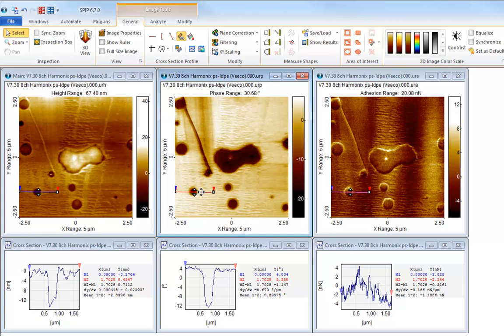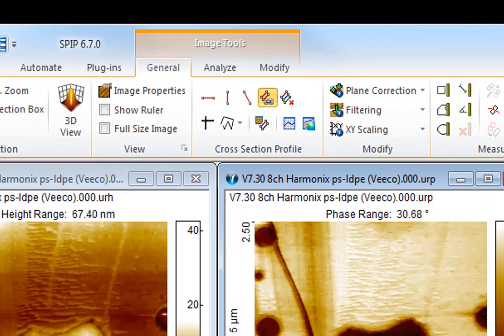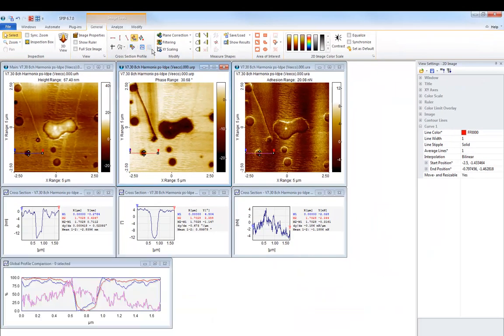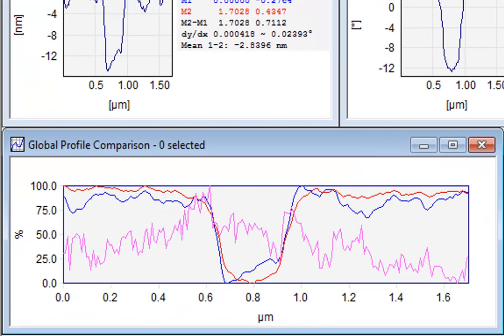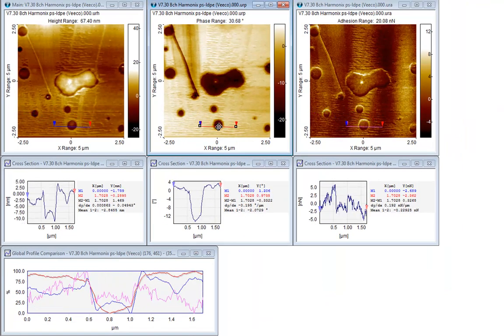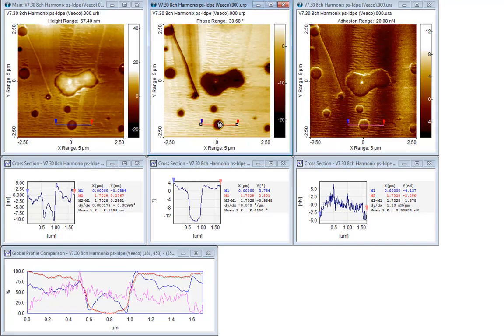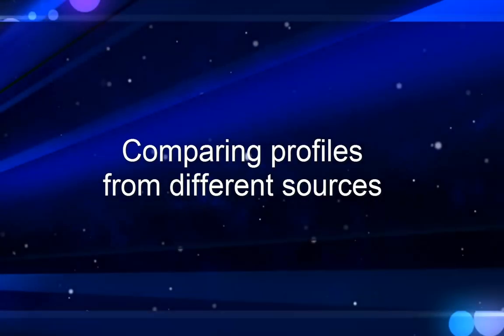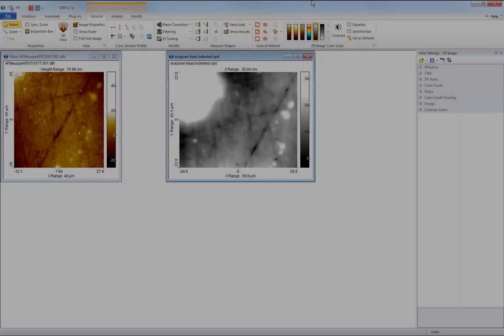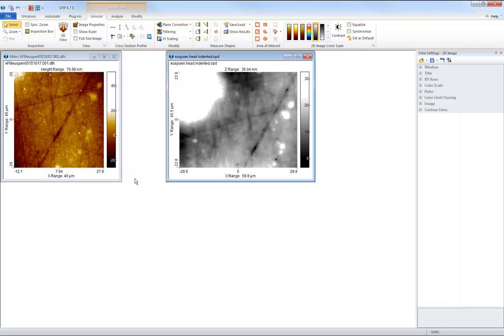As usual, there is one profile window per image. In order to overlay the profiles for better comparison, SPIP has the Global Profile Comparison window. Click this button to enable it. Now all three profiles are displayed on top of each other. Because the units are different, the y-axis is now just a relative scale. The Global Profile Comparison window is also used for comparing cross-sections from images which are not part of the same recording. They can be at different magnification.